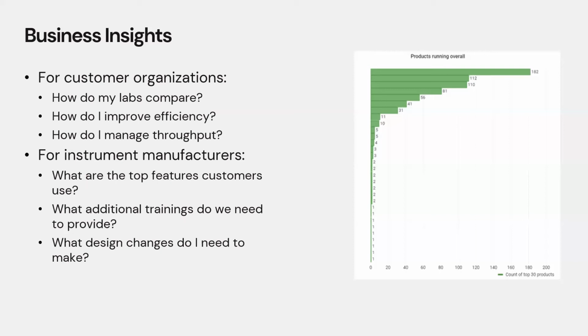Business insights is even more critical for instrumentation manufacturers because this is where they look at a massive number of instruments from many of their customers, so that they can understand what are the top features customers are using and what are the issues they're having with the instruments.